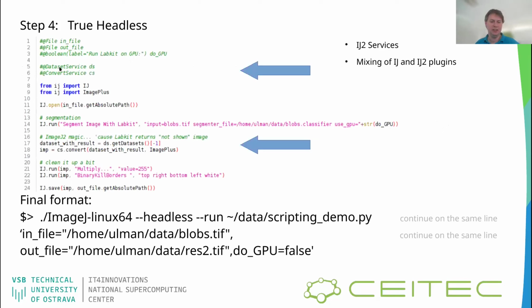So in this very script, I needed to add more of a variables, which are like modern services that are available in Fiji, which helped me to massage data. Problem was that LabKit was not returning the image in the, let's say, traditional Fiji format. The thing is that you also might have heard that there is ImageJ, ImageJ2, and Fiji. So these are three terms and actually slightly different three pieces of software.